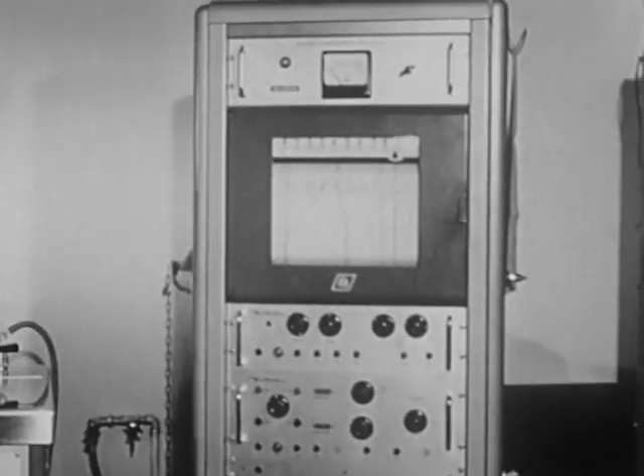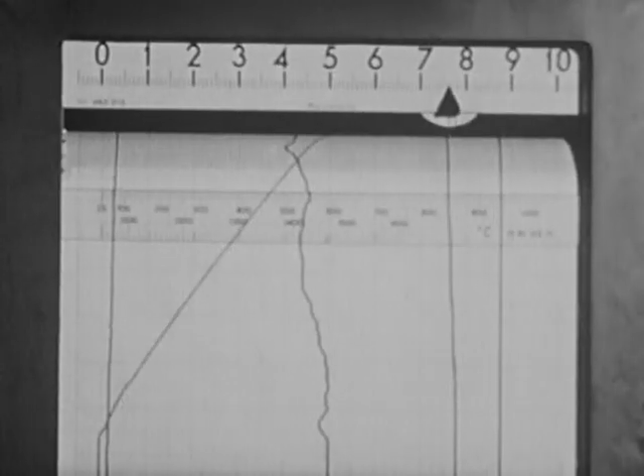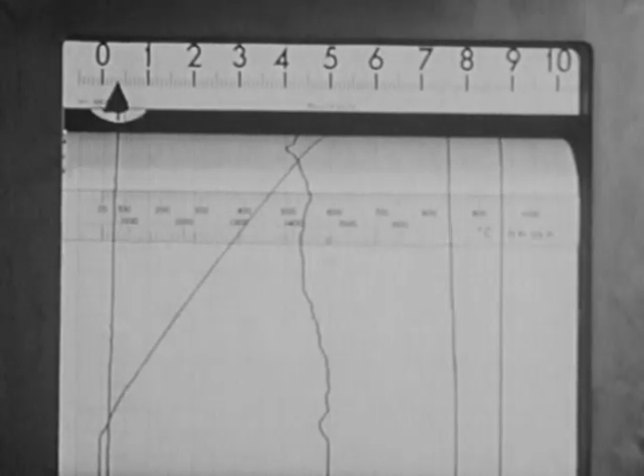This is used for studying different substances, for example metals, under varying temperatures and environmental conditions.